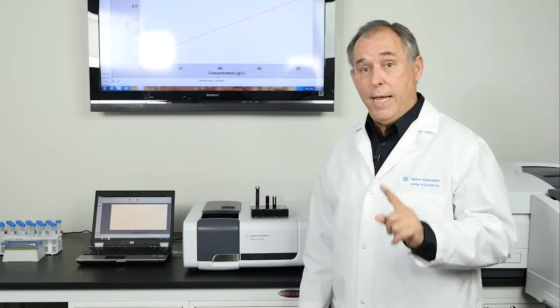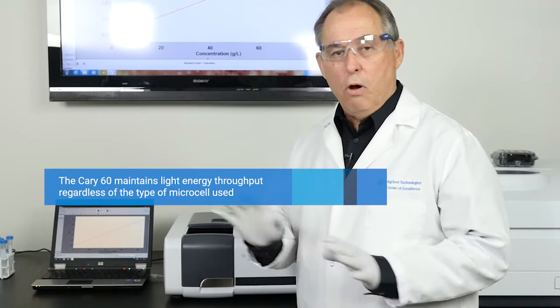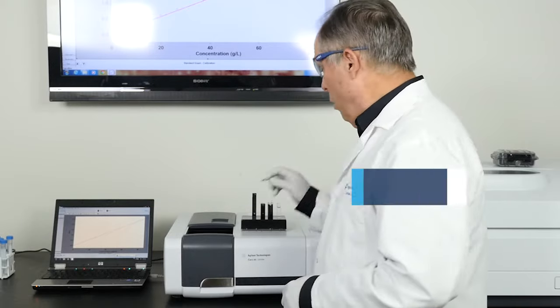I would now like to demonstrate how the Cary 60 maintains the energy throughput regardless of the type of microcell or regular cell you use.